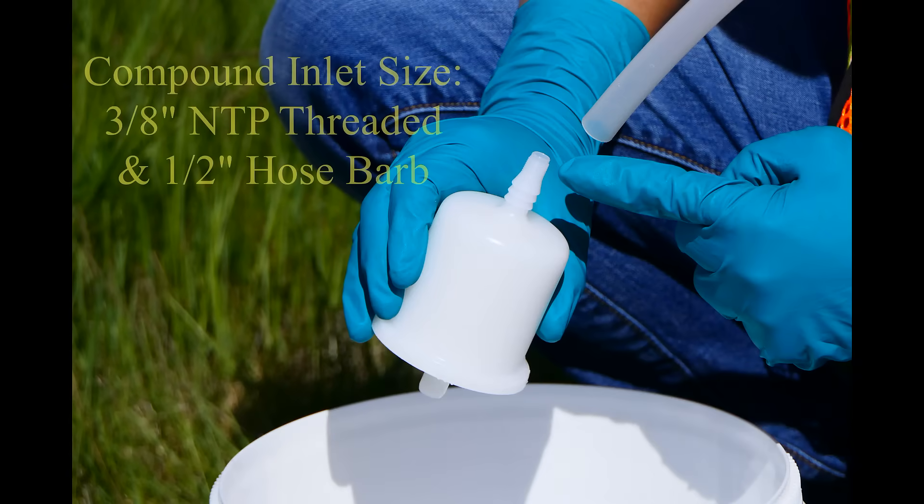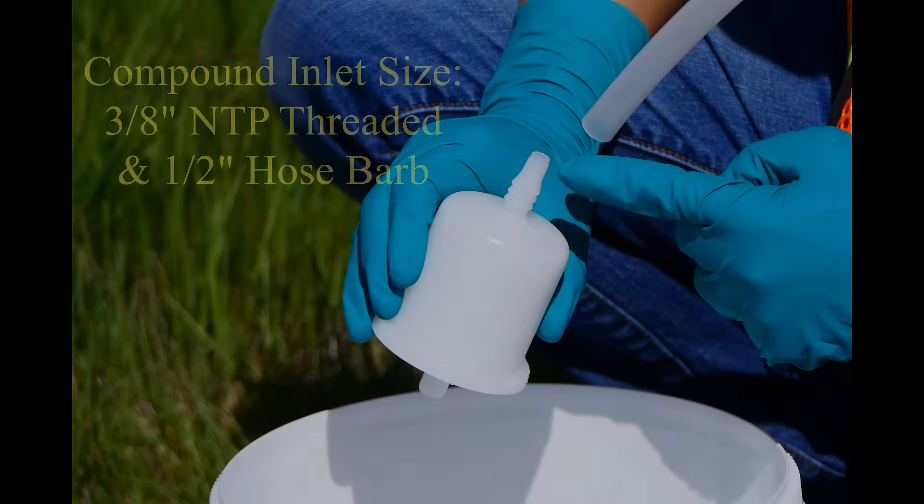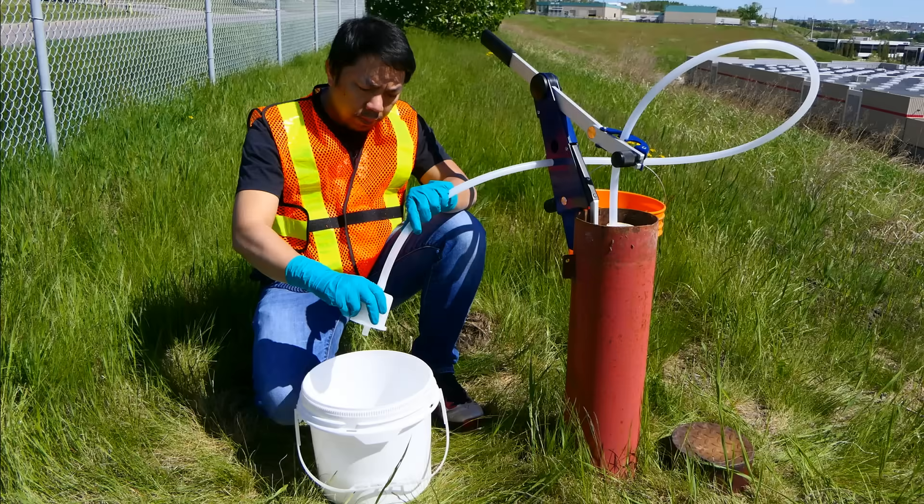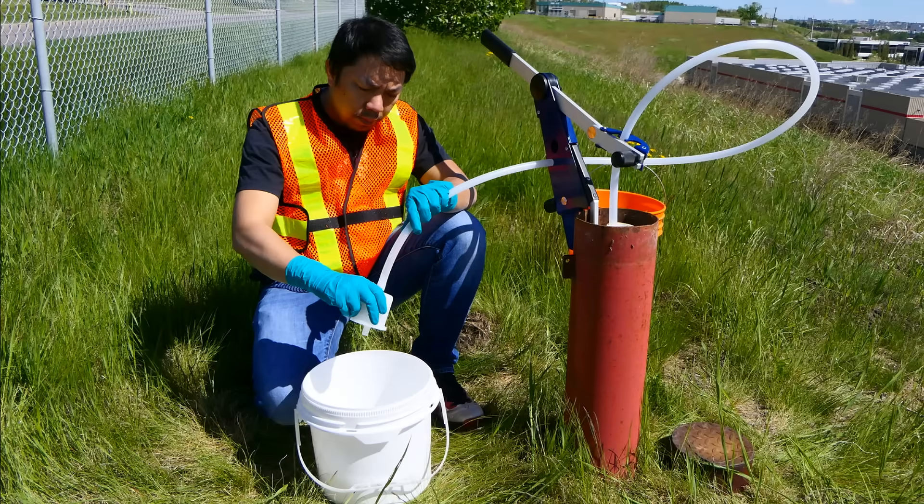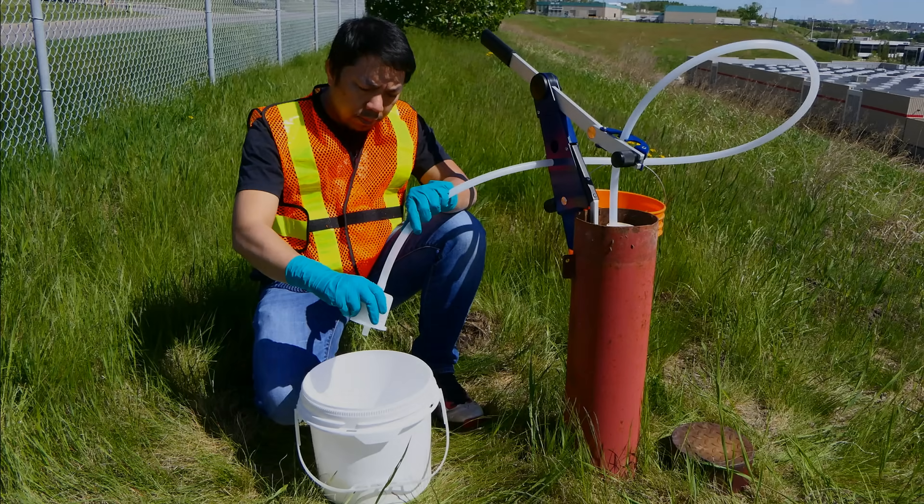Watera filters offer flexibility by providing a compound inlet. Although these filters were designed to work with the Watera pump system, they can be used with most any pump system that can adapt to the inlet dimensions.